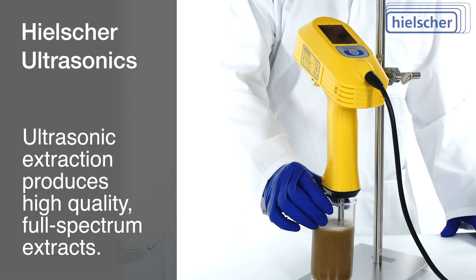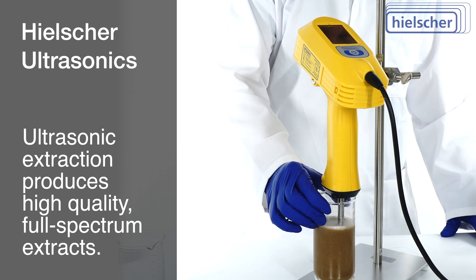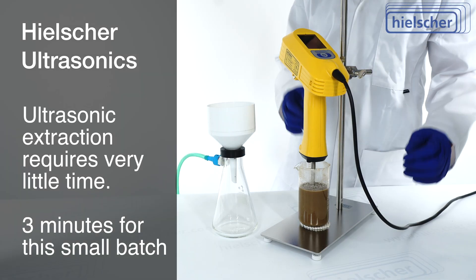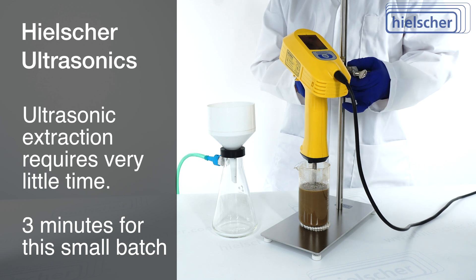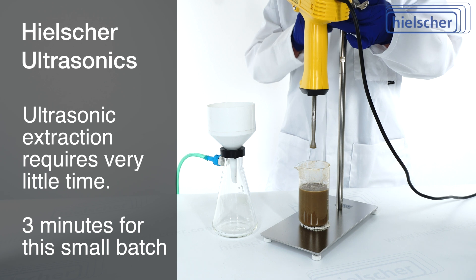Ultrasonic extraction is the perfect technique for producing high-quality, full-spectrum extracts. A short sonication time of only 3 minutes is sufficient for the extraction of the bioactive compounds from the lion's mane mushroom.